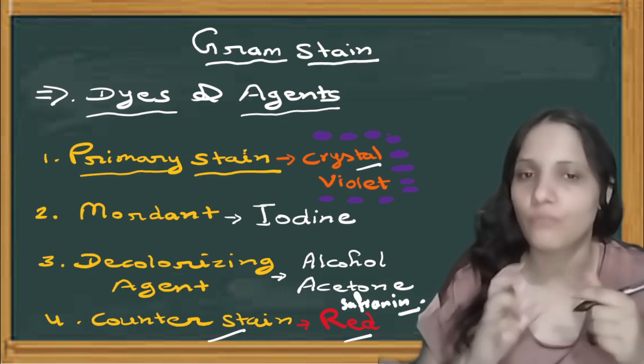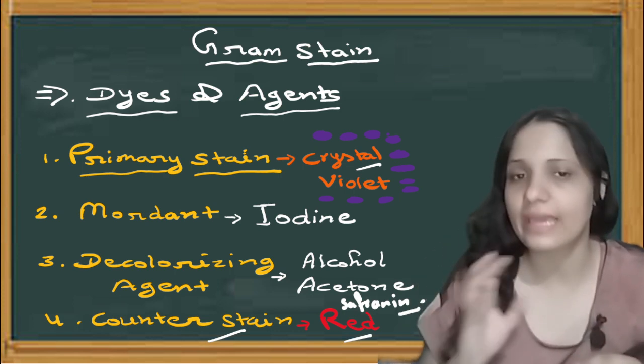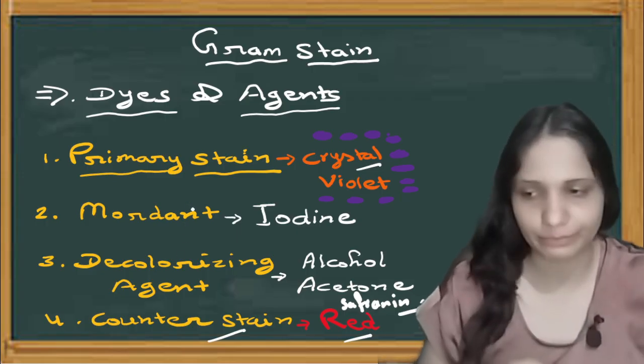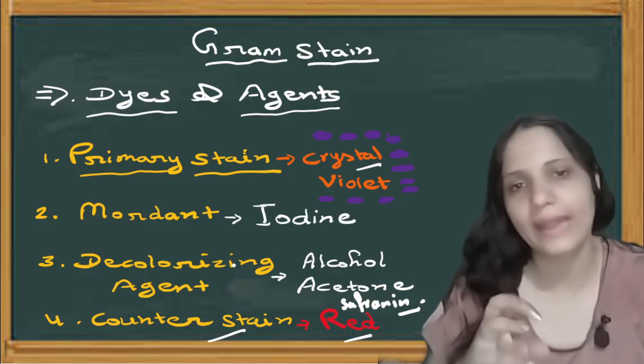It gives a reddish pink color to the bacteria. First just remember the names of these dyes and agents.